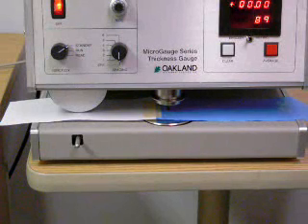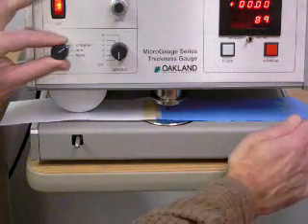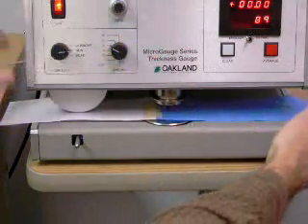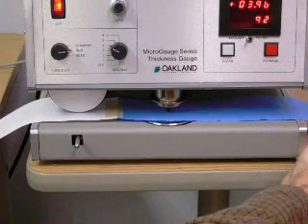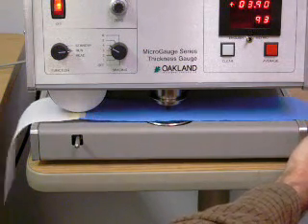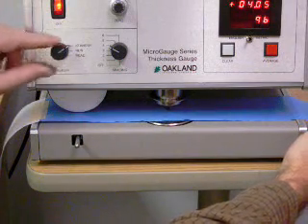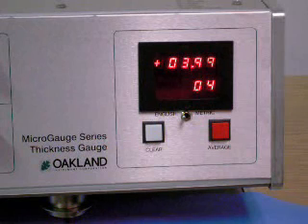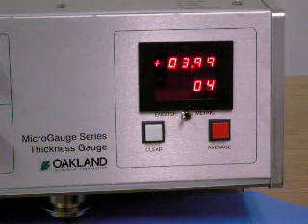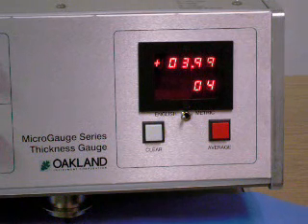Start the drive mechanism to start the test and begin data collection. Stop the drive mechanism at the end of the sample to stop data collection. Press the red push button labeled average at the end of the test to display thickness profile statistics including average, standard deviation, high, low, and count or number of data points taken during the test.